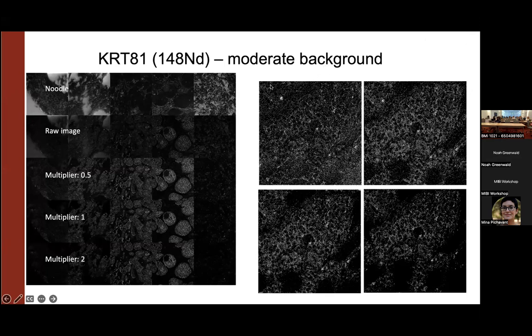The reason we do that is to make sure that, both in the source images and in the target images, if there's what appears to be a 0 pixel, but it's surrounded by a bunch of non-zero pixels, chances are it actually isn't a true 0. And so we smooth it so that there's a better representation of what the signal actually looks like in that area, because then when we do the subtraction, nothing is getting missed.